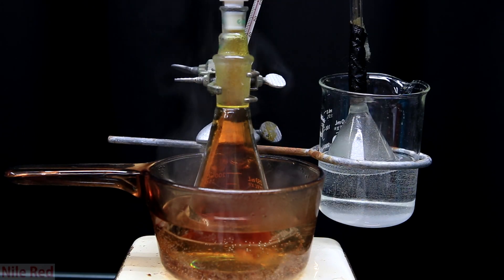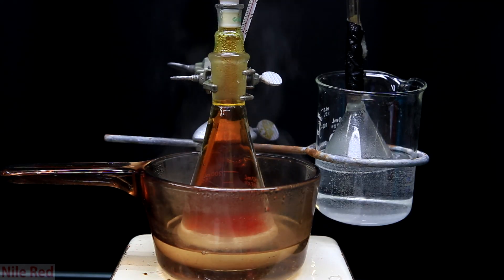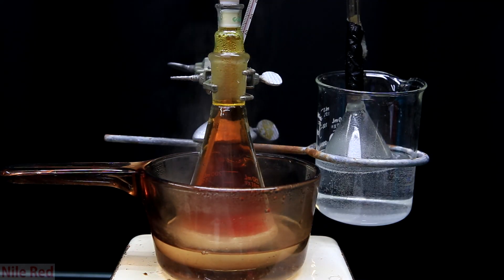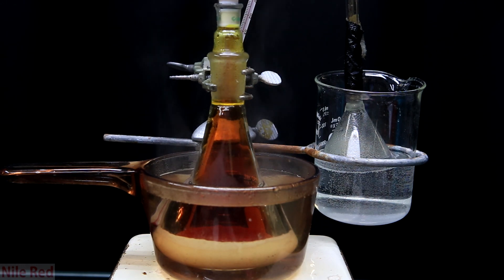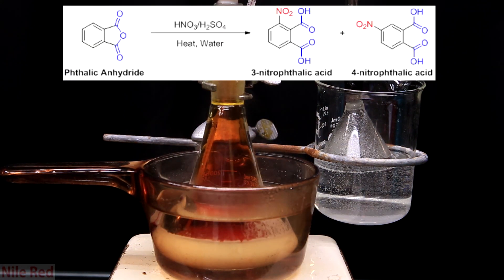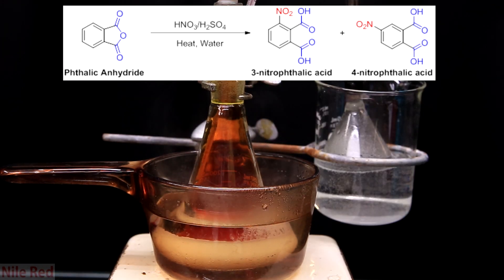Also, the solution will go from being opaque to transparent. As we continue heating it though, it will slowly become opaque again. A lot of the product that's formed isn't soluble so it crashes out of the solution. The reaction that we're performing is a nitration and our product is ideally 3-nitrophthalic acid. Unfortunately, this nitration reaction isn't super specific and it will also produce 4-nitrophthalic acid.